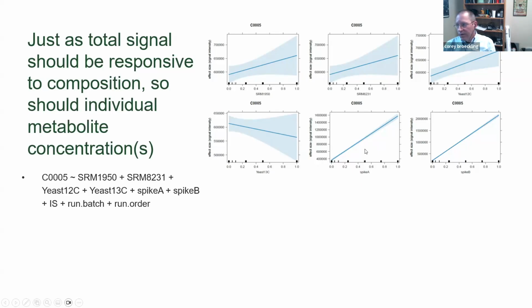And if you look at the p-values, these are highly significant, and these are not. And so what this is telling us, compound by compound, is that this compound likely represents one of the compounds in our 96 mix spike samples. And so you could do this for every compound now.